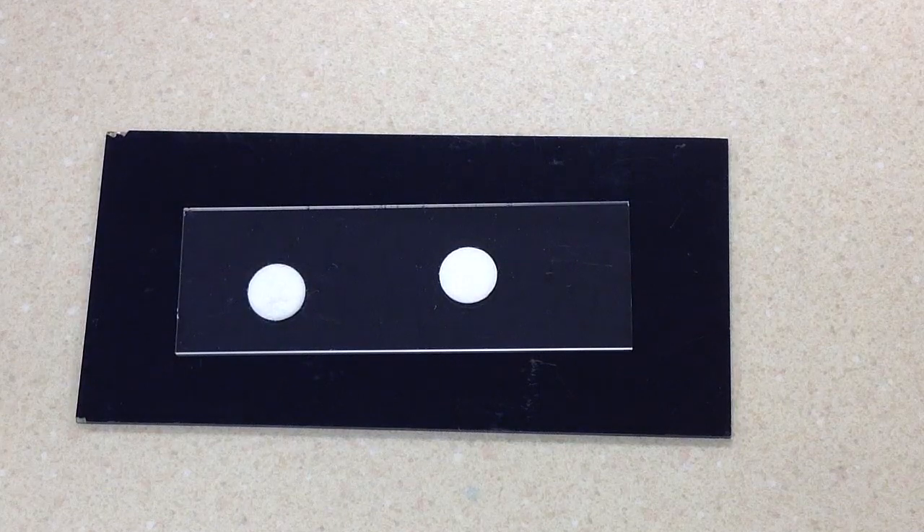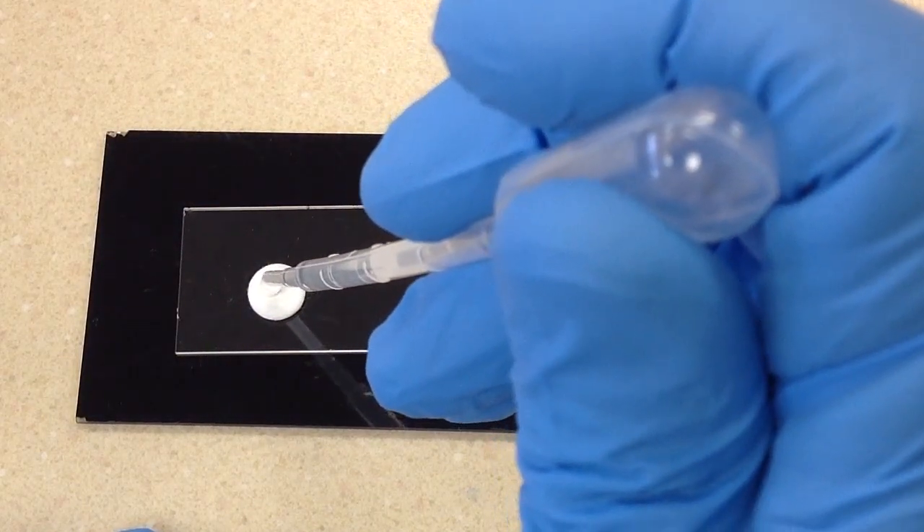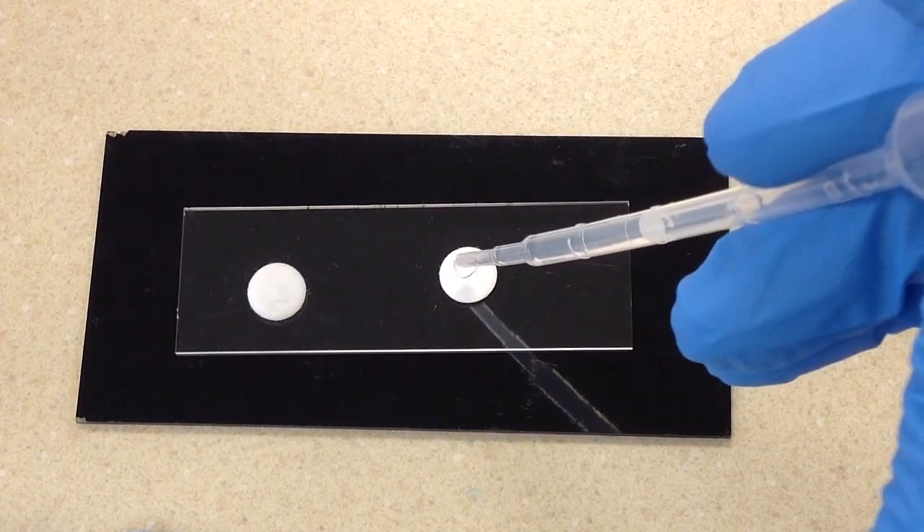So the first thing we have to do is moisten the disk. We don't want to saturate it — just one drop. I'm just using distilled water.